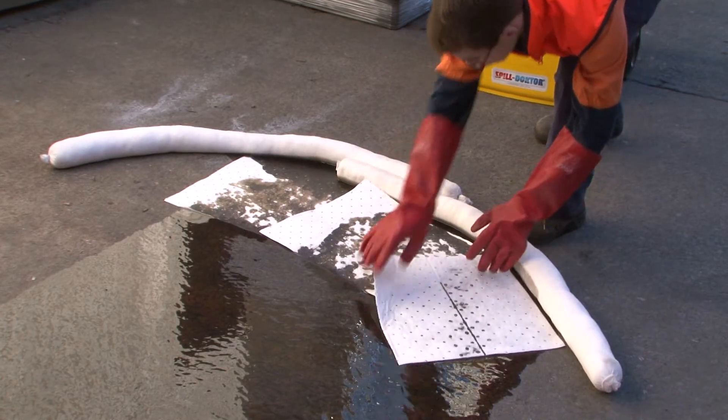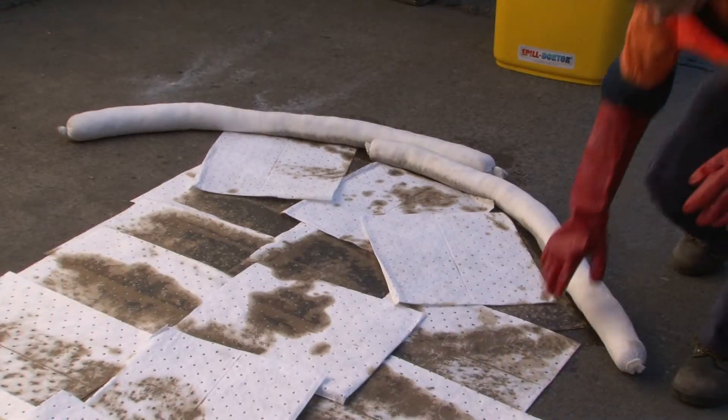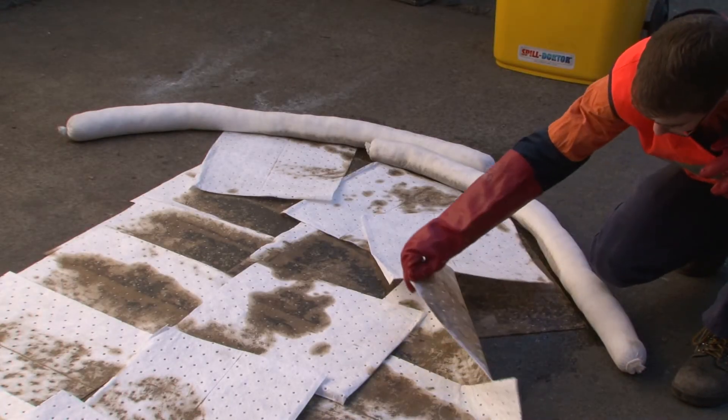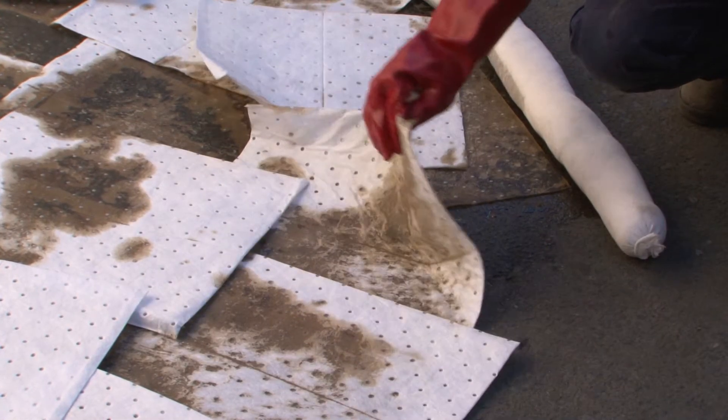Starting at the perimeter of the spill, slightly overlap the pads and work towards the centre until the entire area is covered. Leave the pads in position until they are fully saturated or have completely absorbed the spill.